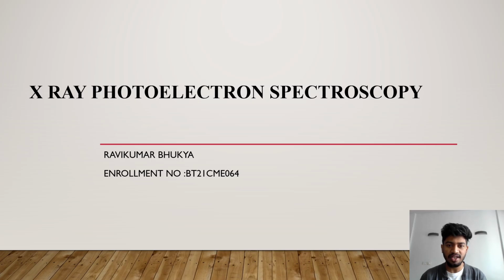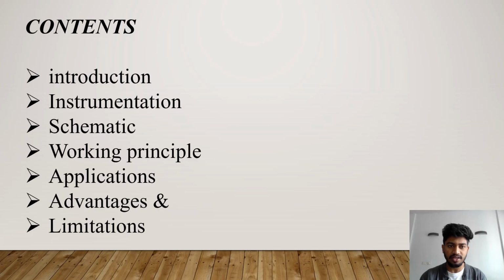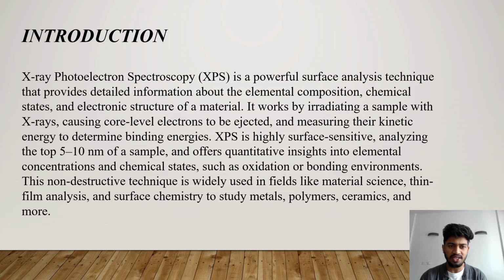We will be seeing many spectroscopies in industries and laboratories as well. This is one of the spectroscopies that we will be seeing in many types of applications. So I'll be starting with the contents. These are the contents I'll be explaining in further slides. We'll be starting with introduction, instrumentation, schematic, working principle, applications, advantages and limitations. So we'll be starting with the introduction.